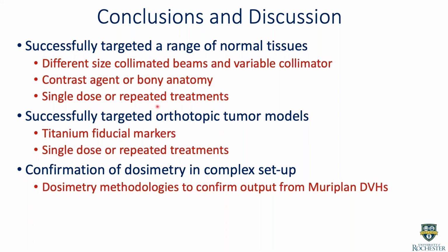With Scott Gerber's group and the shared resource at Wilmot Cancer Centre, we've demonstrated with our SARRP that we can successfully target orthotopic tumours, either in the pancreas or in the colon, using titanium fiducial markers. And this is either after a single dose or repeated treatments, a short course radiation therapy, 5 gray times 5 or 6 gray times 4. And that has demonstrated difference in outcome in terms of tumor response and radiation.